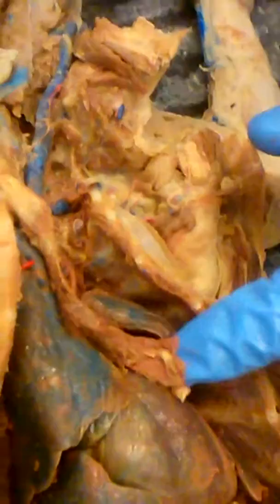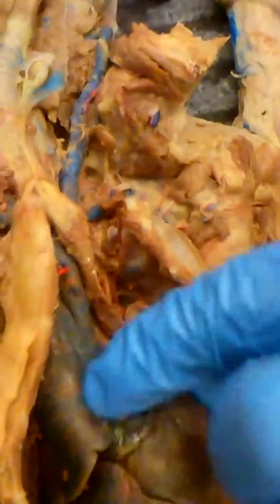If anything is on the heart or relatively close right here, it's going to be the thymus. And the pancreas is right here, like this little membrane. If it's on the mesentery, it's going to be the pancreas.